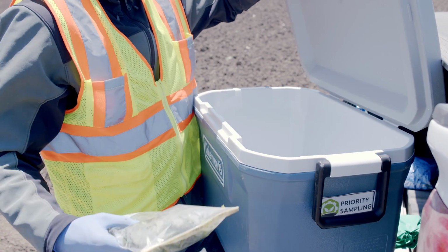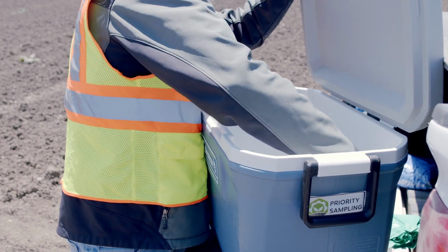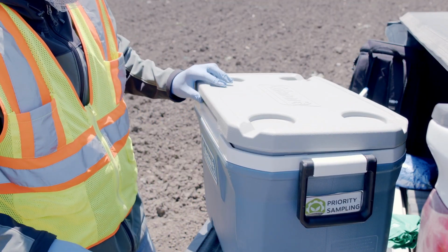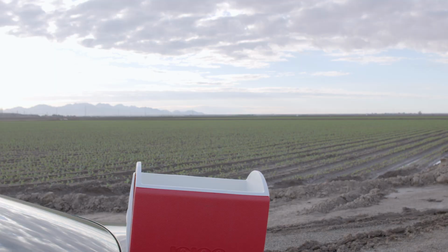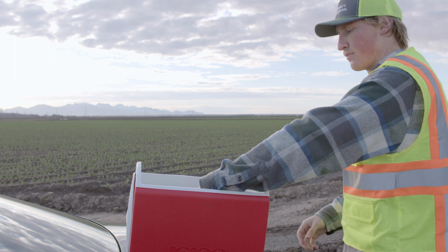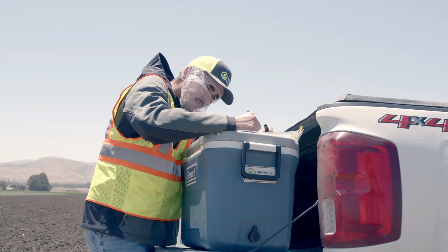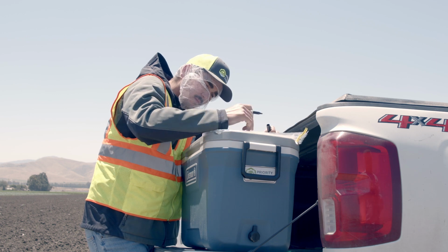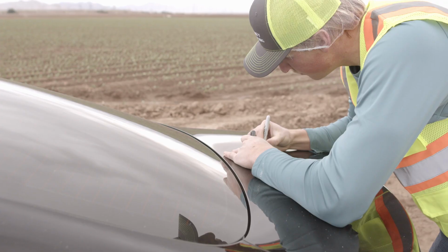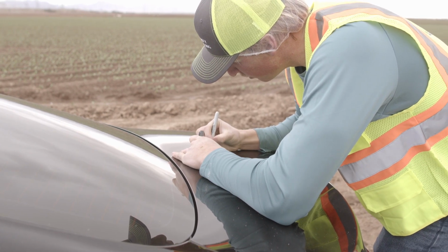Place samples in a cooler and do not freeze the sample. It is a good practice to place a barrier between sample container and the cooling medium to prevent tissue freeze injury. Do not use ice. Use blue ice or ice packs instead. Fill out the chain of custody form properly and accurately with sample collection information and document any deviation.